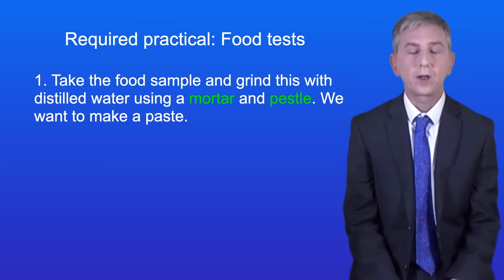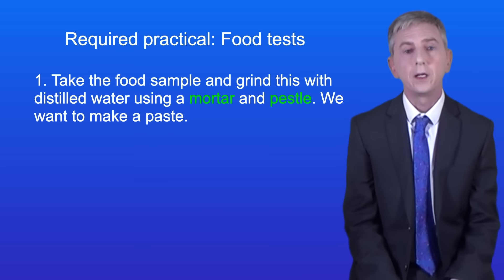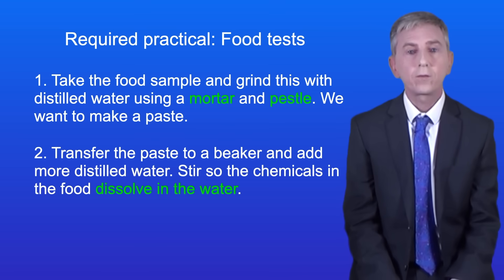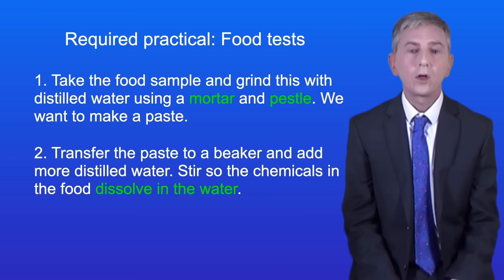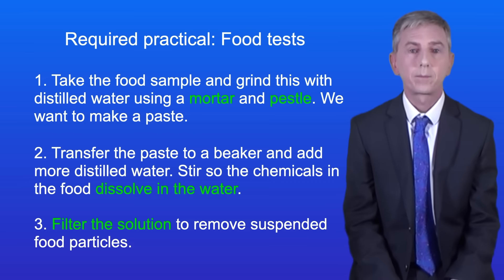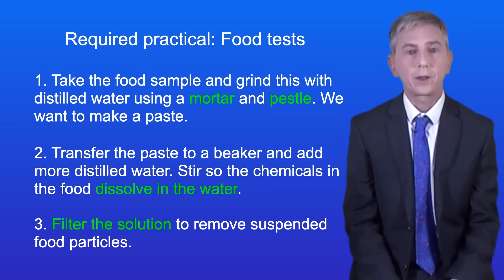First we take our food sample and grind this with some distilled water using a mortar and pestle — we want to make a paste. We then transfer the paste to a beaker and add more distilled water. We stir this so the chemicals in the food dissolve in the water. Next we filter the solution to remove suspended food particles. At this stage we can test our solution for the chemicals present.